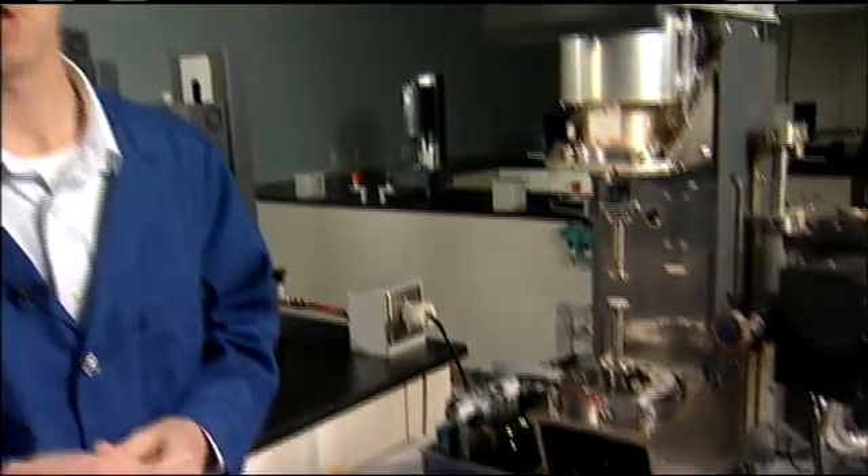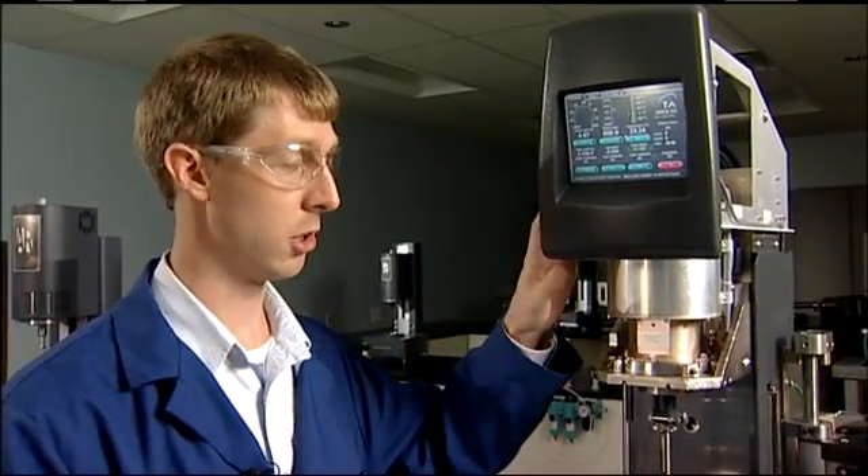Sure, it's a little bit more expensive, but worth every penny. I think our competitors would agree. Pure measurements, fewer corrections, better data. There's only one rheometer in the world capable of independent stress and strain measurements — it's the Aries G2, and it's the number one reason why it's the world's most powerful rheology platform.